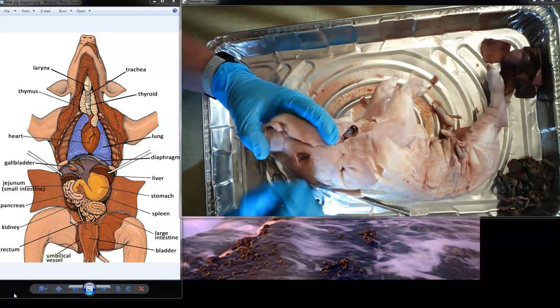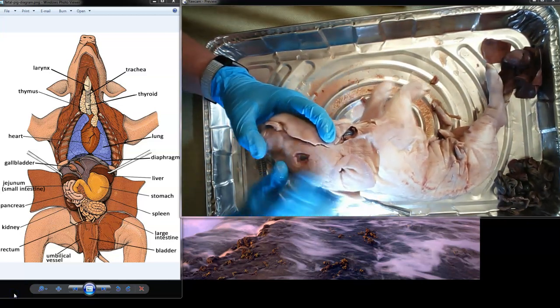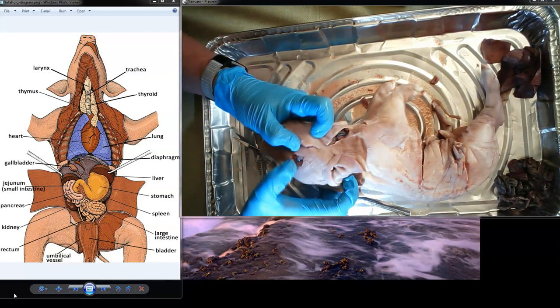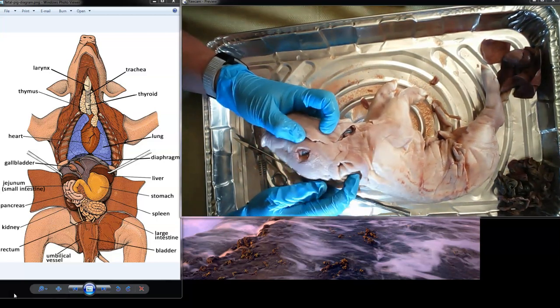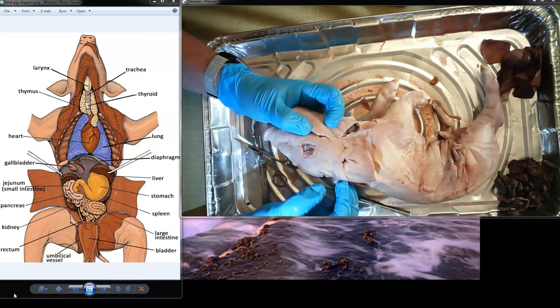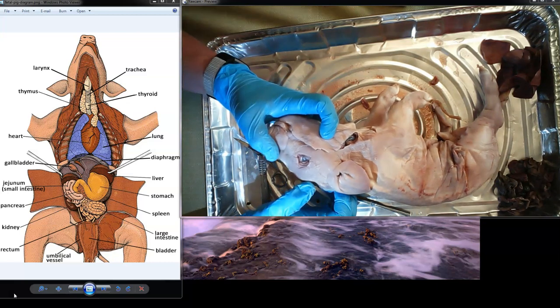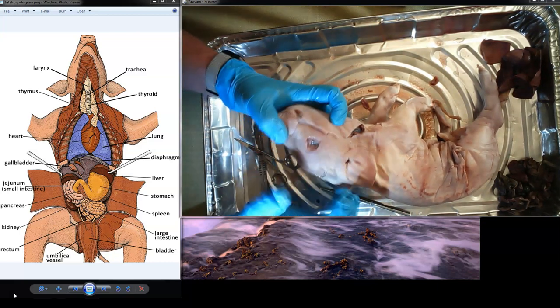Okay. So I've cut two more parts of this pig that we can take a quick look at. There's not really much to see here with the eye. The eye has a membrane on top of it that stops the eye from getting irritated. So it basically is an extra layer of closing material, closure on top of the eye. And it keeps the eye protected.